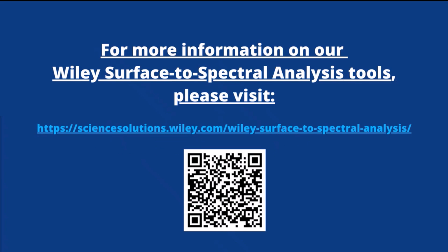Here's another one. After baseline correction, new peaks appeared, which were not very prominent in the first place prior to the correction. Can you expound a little bit more on that, Liana? Yeah, I think the display at the bottom, if nothing is selected, is some sort of weighted average or composite.